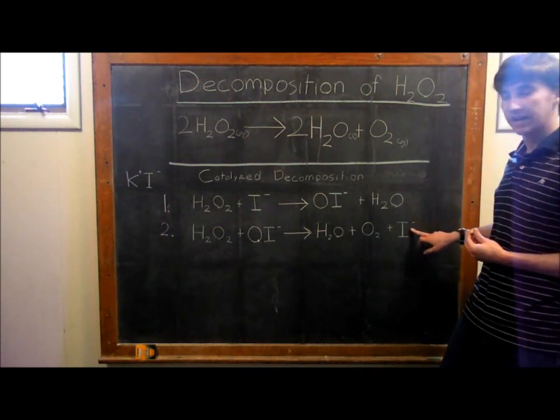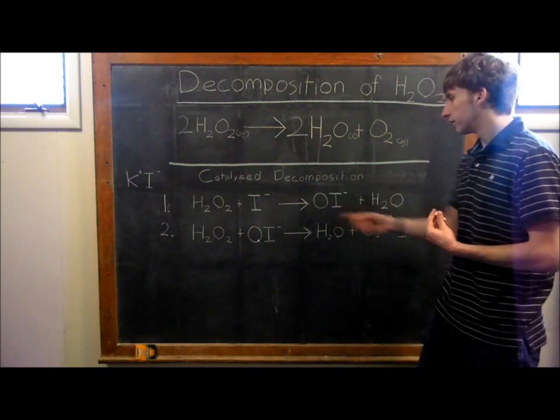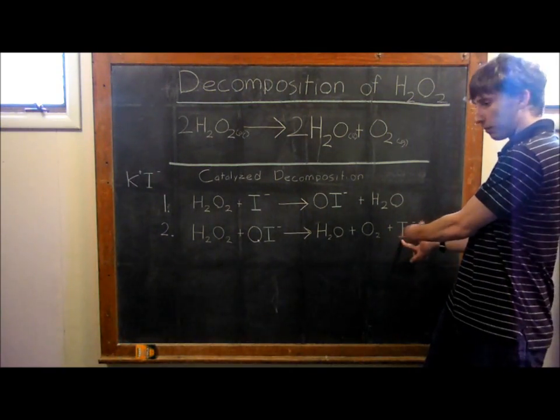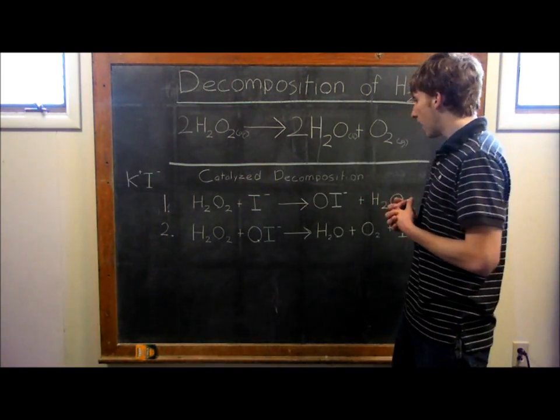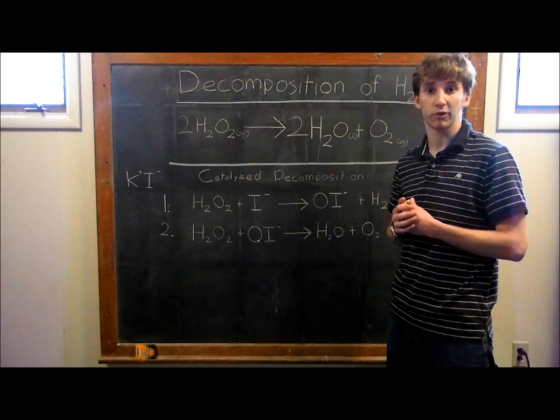So this I- can actually participate in this whole process again, and that's actually what happens. So when I- is used up here, it'll be one of the products here, and it'll just keep going through this whole process again and again and again until there's no more H2O2 to react. That's about it. So now in a couple minutes, we'll be getting to the fun part of the actual reaction.